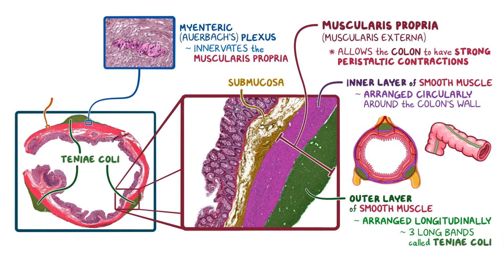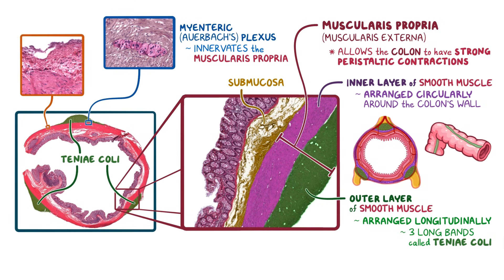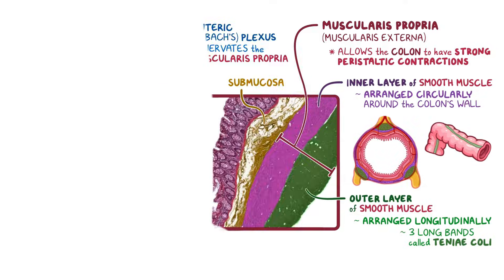Some portions of the colon will have an additional thin layer of connective tissue that surrounds the muscularis propria, called the serosa.